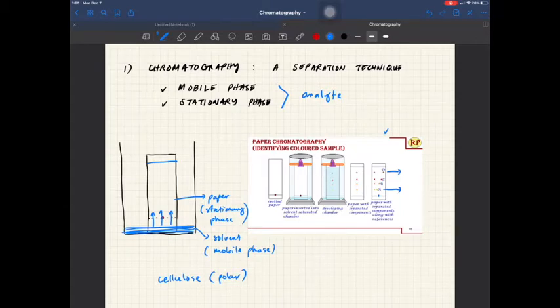One of the most relevant analogies for this is, suppose you are walking along with your friends, this is you, and along the way you see someone you like, and your friend also sees someone he or she likes. So what happens here is that since you like this person at this point, so you have A, B, C. So B tends to stay a little longer compared to A and C. And as A and C move along this path, A is attracted to this.